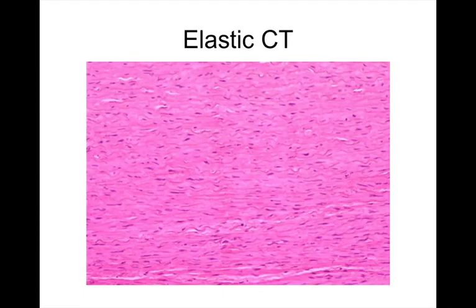Interesting. All right, elastic connective tissue. So in elastic connective tissue, the elastic fibers are darkly stained, and the example given in class, I think, is really good: it looks just like layers of lasagna. Yeah, I buy that. These aren't as apparent, though, are they? Here, right around here, I can see it okay.